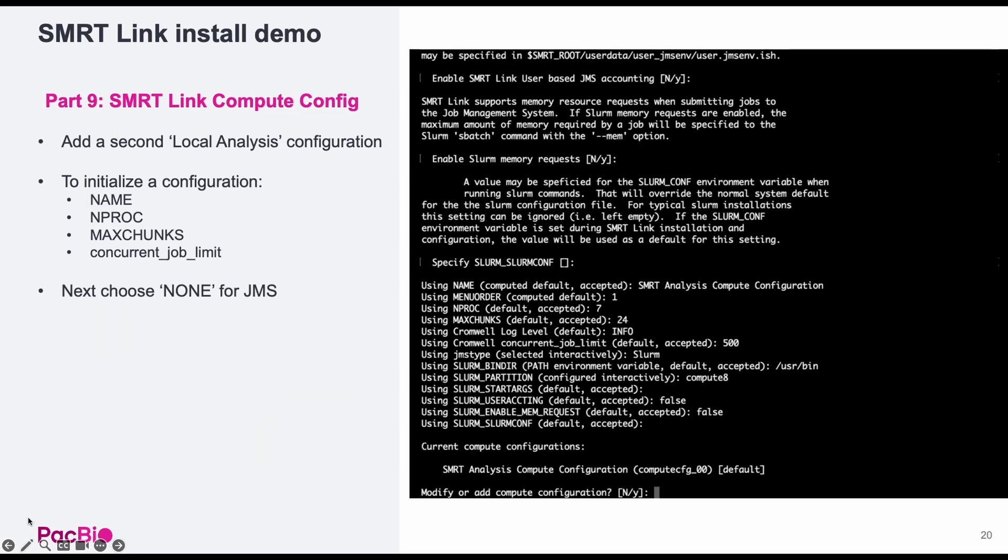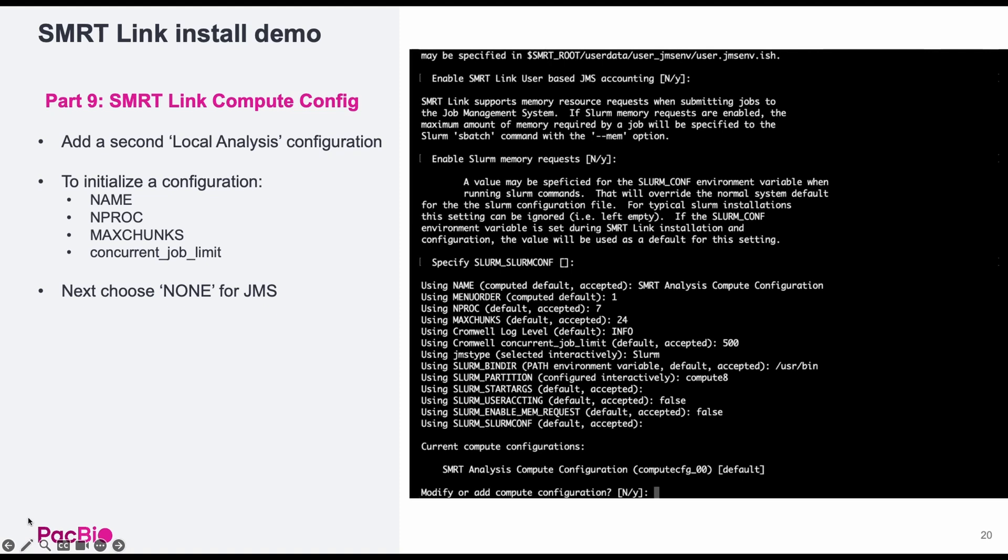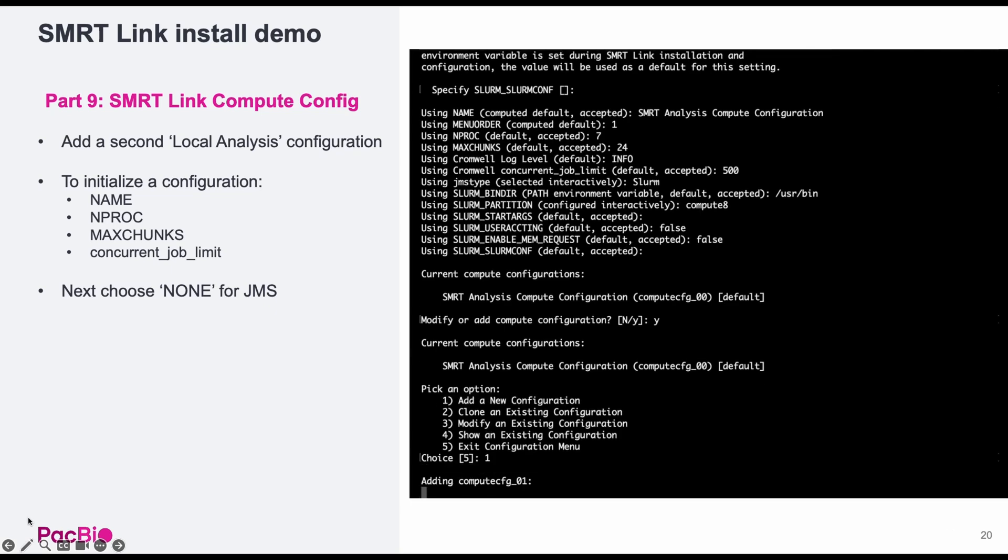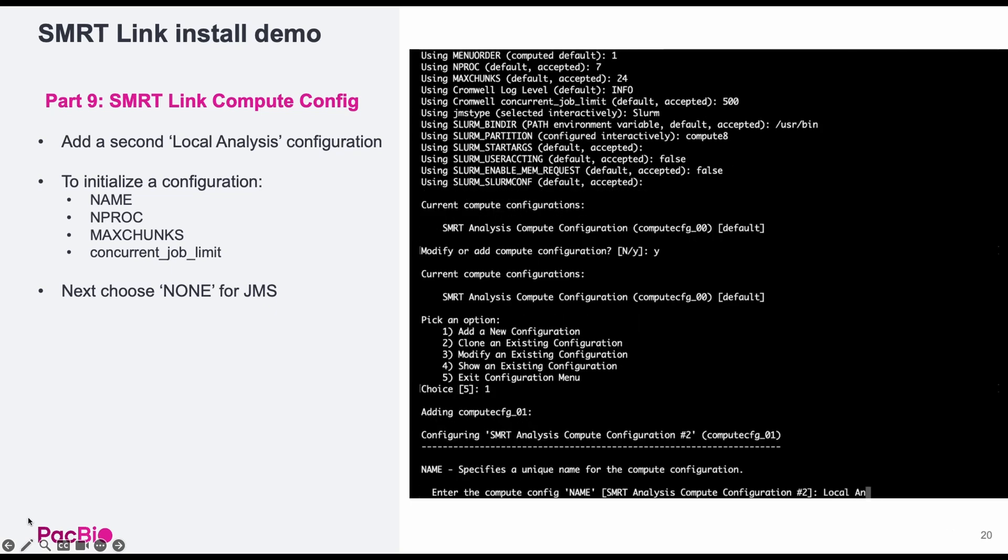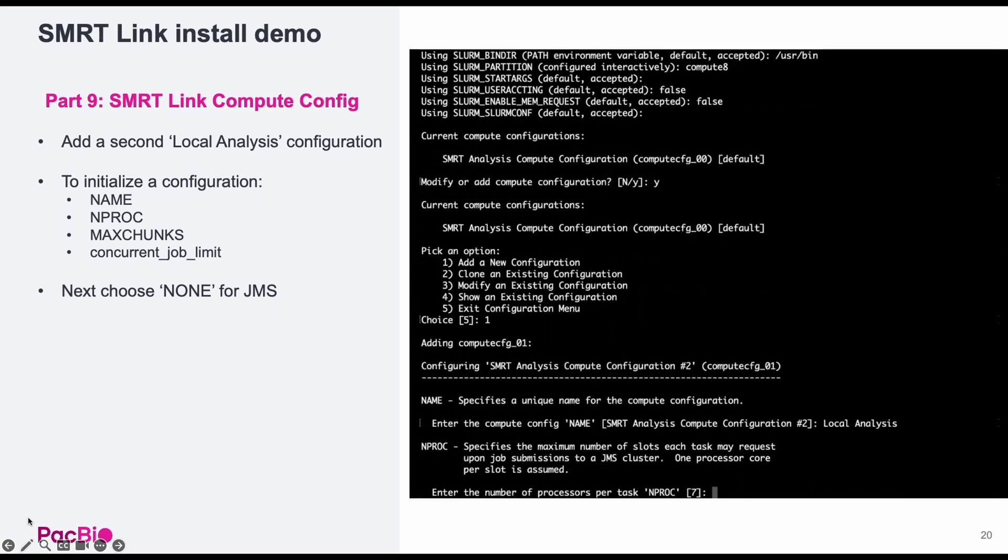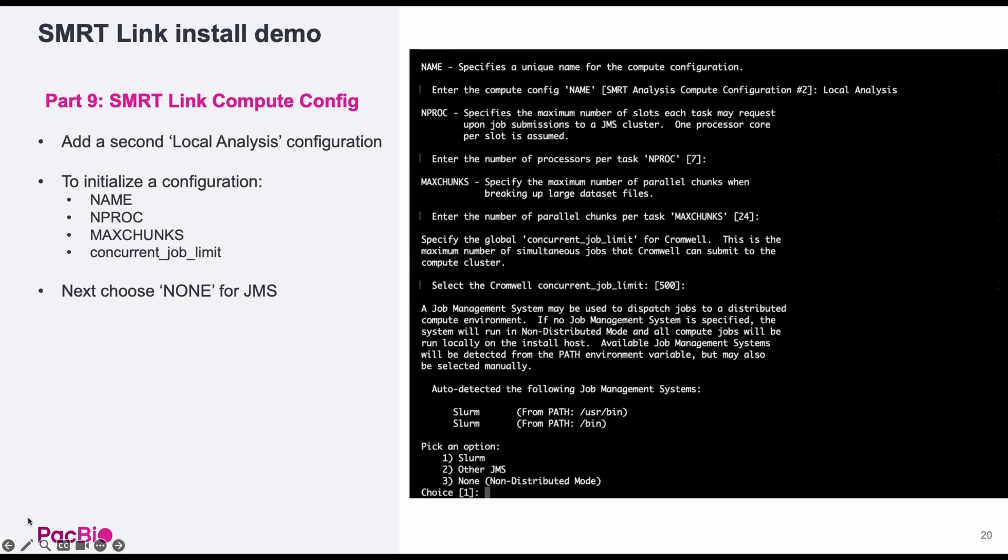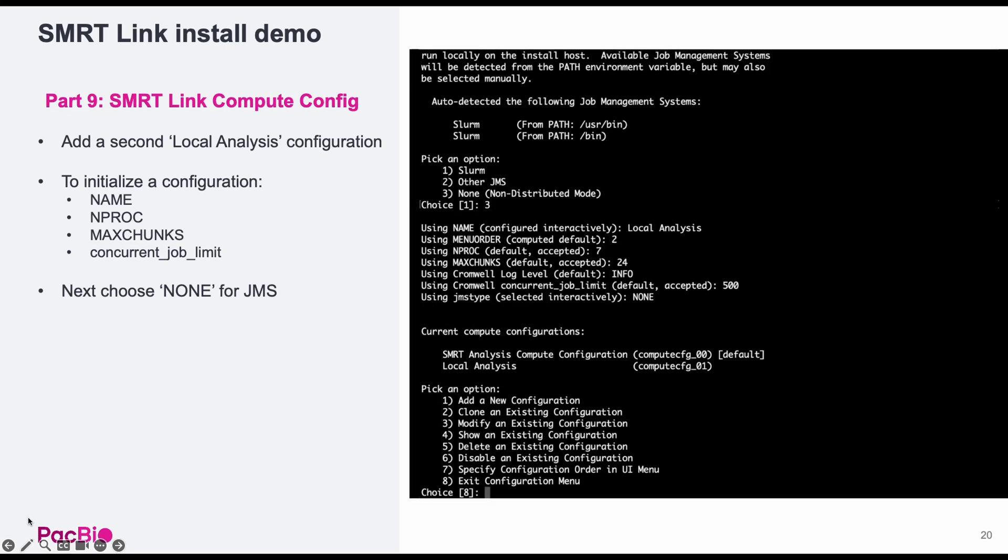Next, you will be asked if you want to add any additional compute configurations. For this demo, I will be adding a second configuration for a local or non-distributed submission configuration. Here I've named the configuration local analysis, accept the default settings, and then chosen to use none as the JMS type. After this, you can exit the configuration menu by hitting 8.